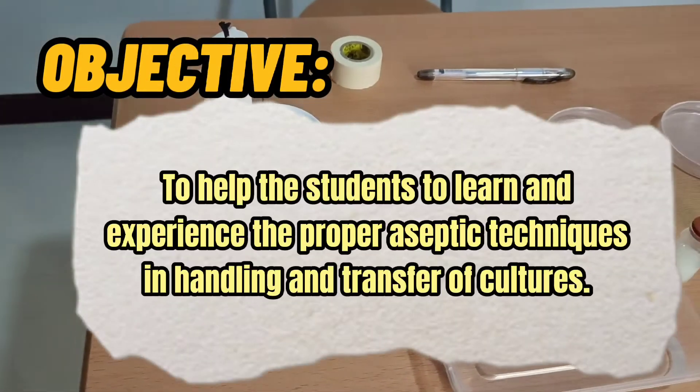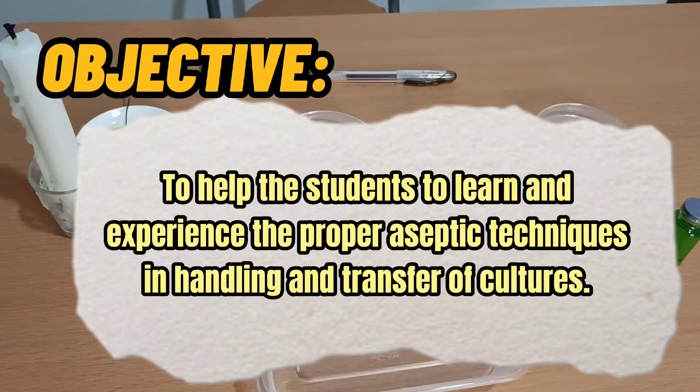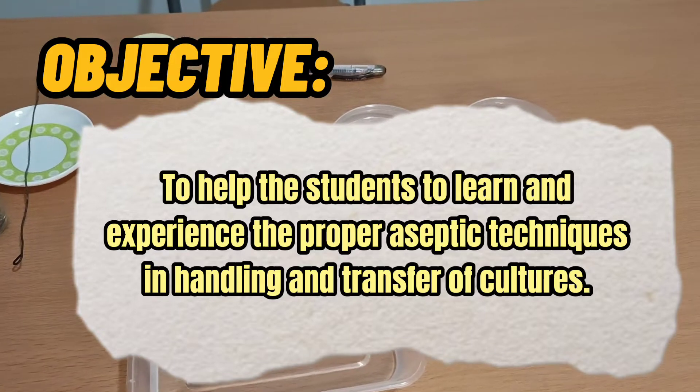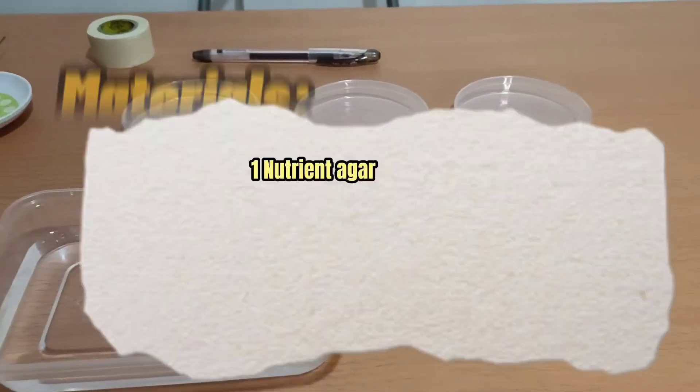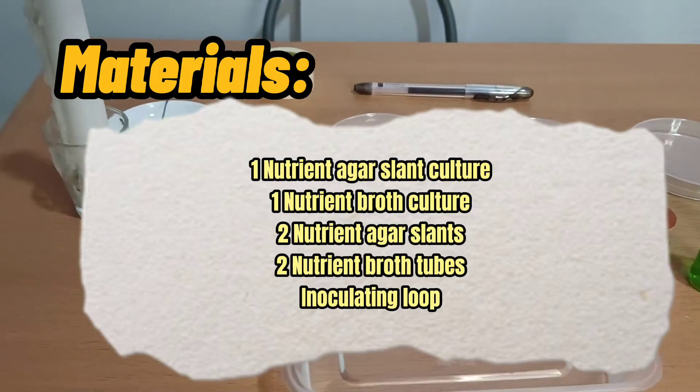The objective of this exercise is to help the students learn and experience the proper aseptic techniques in handling and transfer of cultures. And here are the needed materials for this exercise.